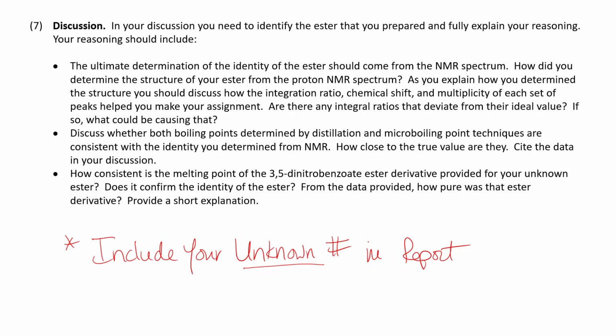Do that. How consistent is the melting point for your unknown? Does it confirm the identity? From the data provided, how pure was that ester? Also in here, go ahead and include your refractive index, which is the nD20, and how close it was as well.